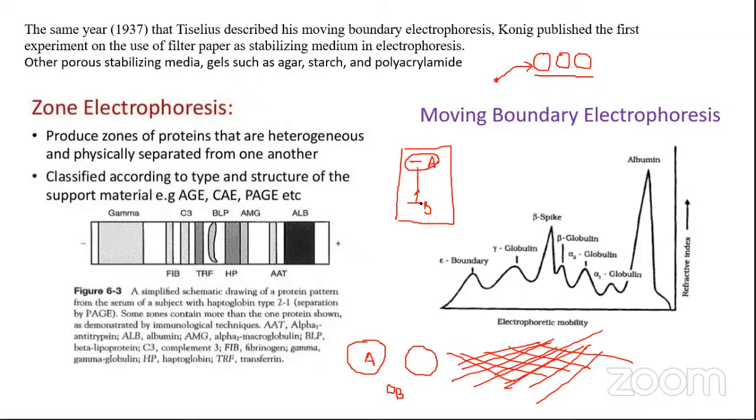Although B can diffuse, you can use certain ways in which you can stop this diffusion later. Once electrophoresis is done, once you stop the current, then this movement of B can also be stopped. That we'll talk about later when we discuss gel electrophoresis in greater detail. But all in all, does that sound to be a better option compared to the moving boundary electrophoresis system? Yes, sir. Prevent diffusion? Yes, it sounds to be a better option, right?